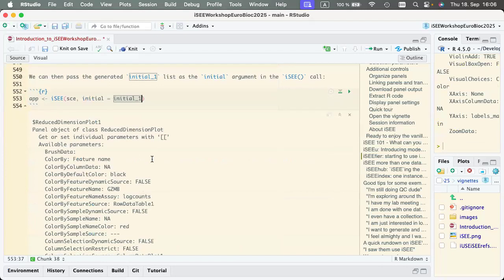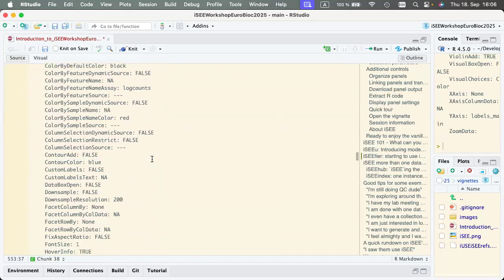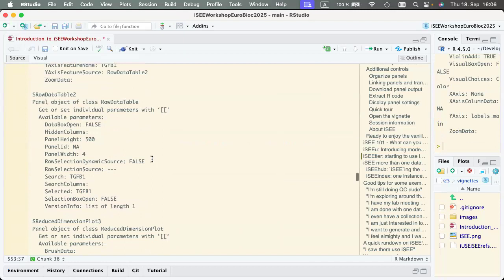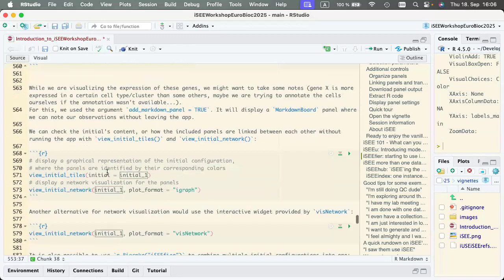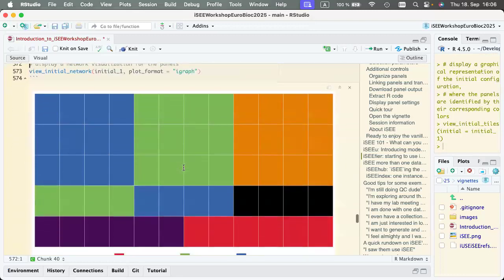That's actually the list view of that, but you don't need to know that it looks like that. You can simply view it as a tile so that you can have an application. I told you it's a mouthful. So we can see how it looks by simply having this kind of app-like summary of that.